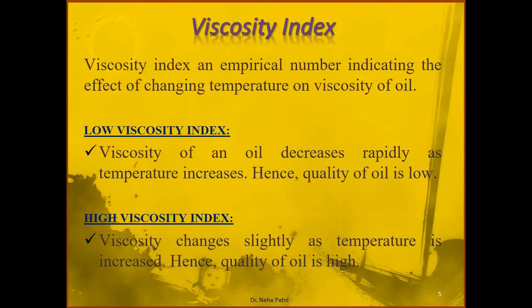Now we have to express that viscosity in terms of viscosity index. Viscosity index is nothing but a number, a rating which is given to an oil with respect to its quality. And here we have to focus on the change in viscosity with respect to temperature. We all know that viscosity and temperature are inversely related. If I increase the temperature, viscosity decreases. So I want to know the effect of temperature on the viscosity of oil, so that whenever you use that oil as a lubricant in the machine and there is a change in temperature, what happens to the viscosity of the lubricant, that is the concern.